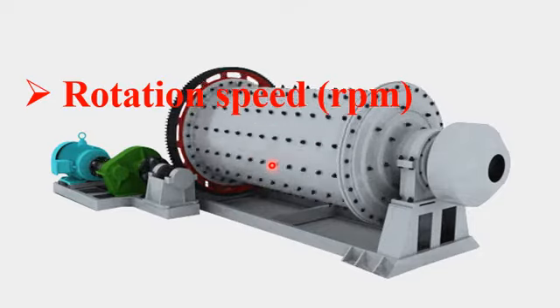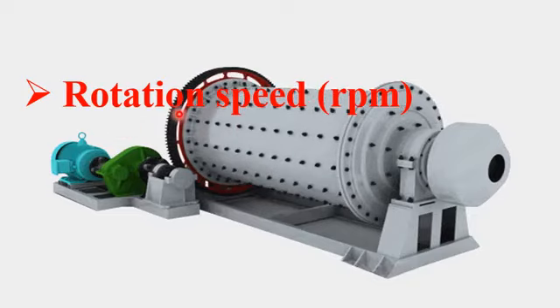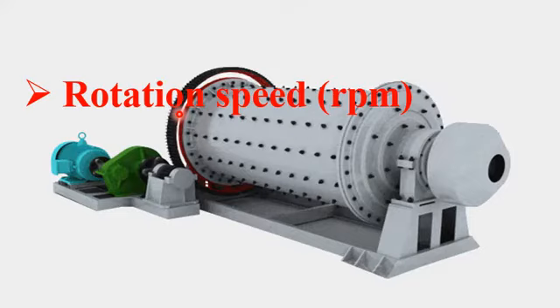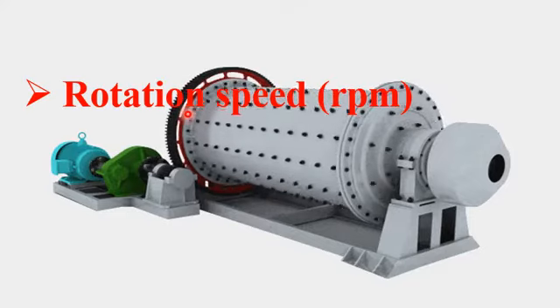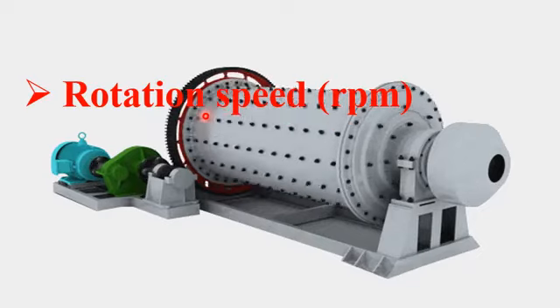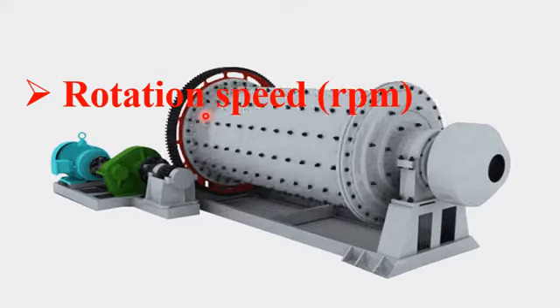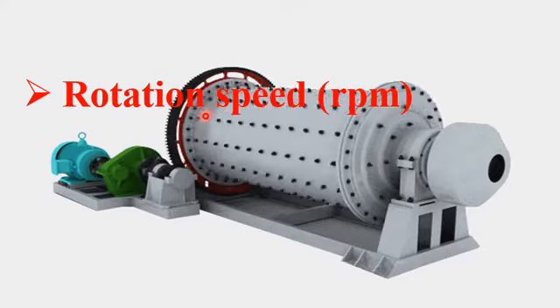Okay, dear student, please note that the rotation of the drum in the opposite direction to the revolution is more effective in order to get very finely ground nanoparticles.